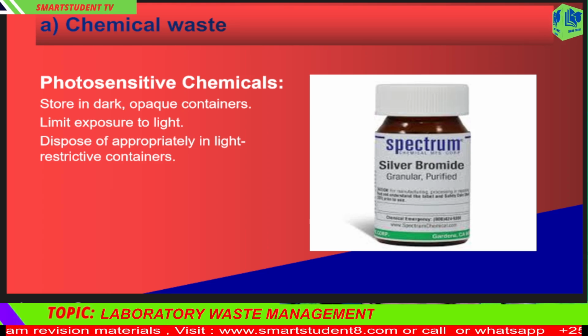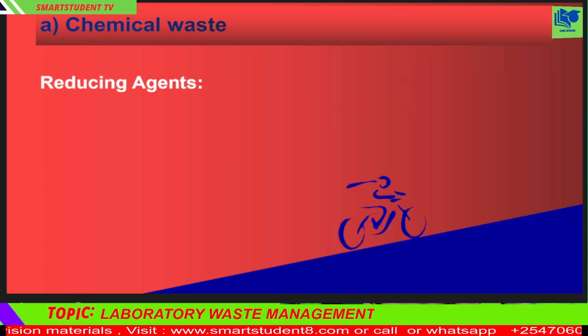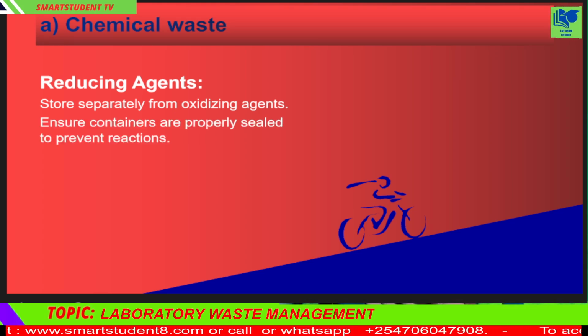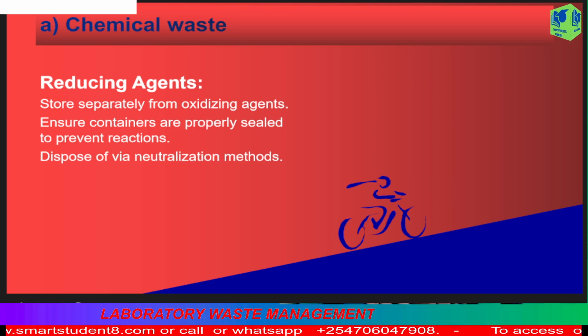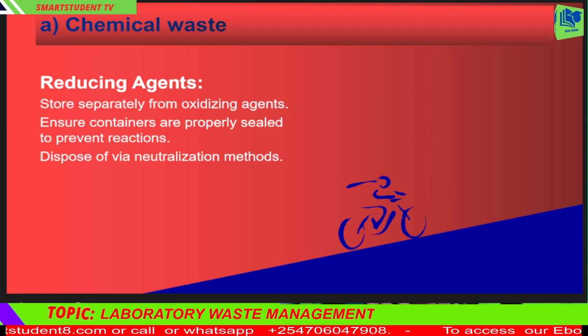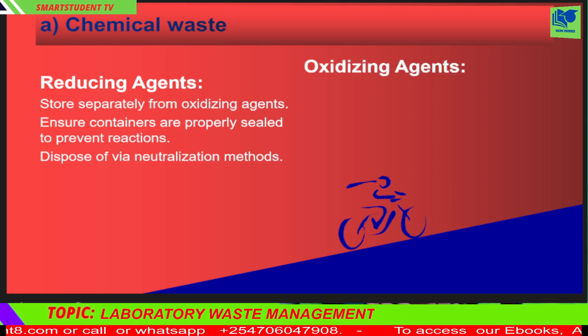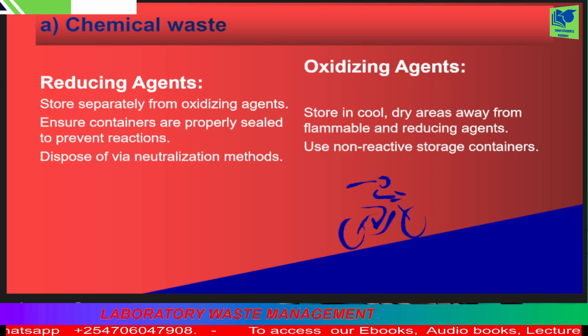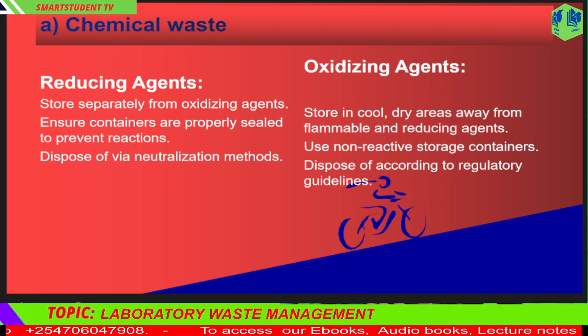H. Reducing agents. Store separately from oxidizing agents. Ensure containers are properly sealed to prevent reactions. Dispose of via neutralization methods. I. Oxidizing agents. Store in cool, dry areas away from flammable and reducing agents. Use non-reactive storage containers. Dispose of according to regulatory guidelines.